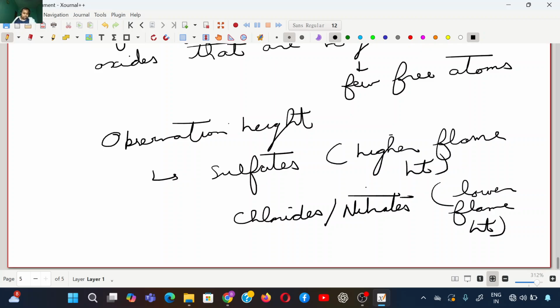Okay, so likewise, in some refractory structures and polymeric cases, you'll have metals which form very stable compounds in the flame, okay? And those refuse to break apart into free atoms, thus reducing the number of free atoms available and reducing the signal. I'm not getting into the details of all that. But you can give examples like ilmenites, perovskites, and whenever elements involved are titanium, zirconium, hafnium, molybdenum, silicon, etc. Because those compounds are very stable and the atoms get locked inside, we have lower absorbance.